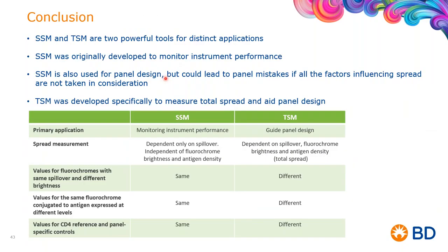Just as a conclusion before we open up for questions, I just want to reiterate, SSM has been adopted as a predictor of spread. It's a great tool, originally defined for instrument performance monitoring. It has some challenges and limitations that we showed you for panel design specifically, and some of these can now be overcome using TSM, more specifically for panel design.